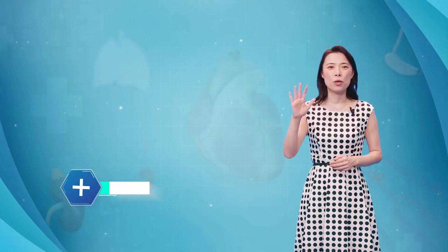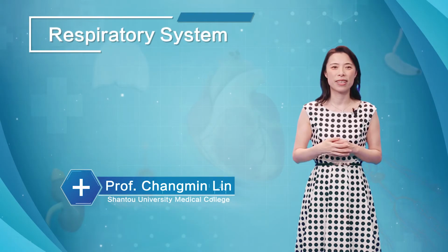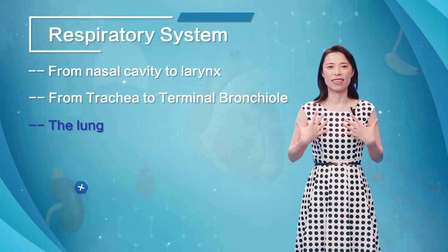Hi everyone, welcome to the histology of the respiratory system. Let's get on with the third topic, the lung.